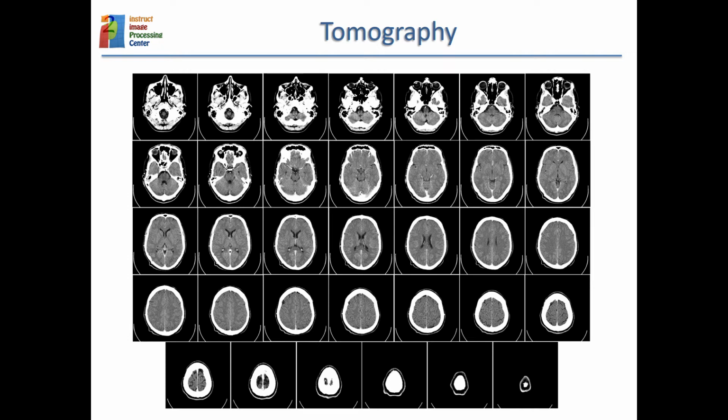And looking at the volume in 3D through the slices, I would say this is the first step towards recognizing artifacts in the 3D reconstruction, because very often you see streaks or stripes outside the object of interest.